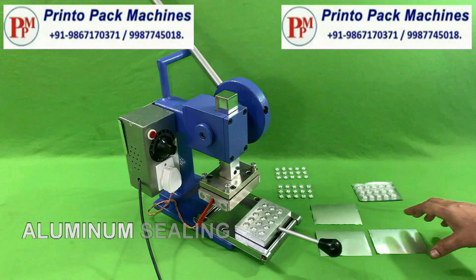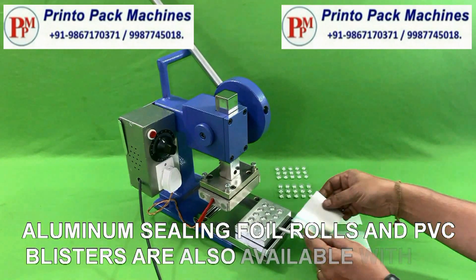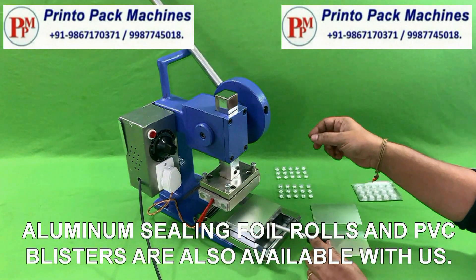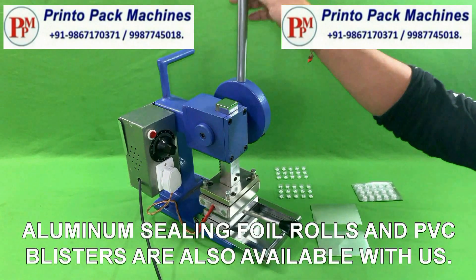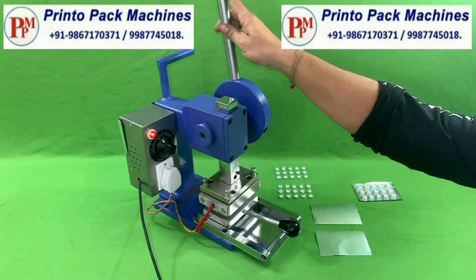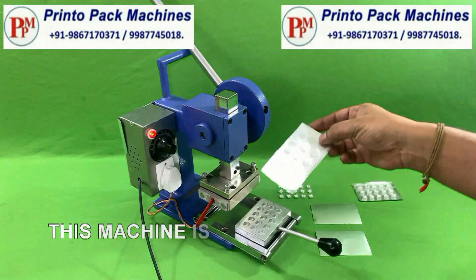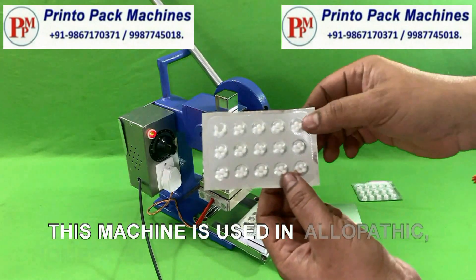Aluminum sealing foil rolls and PVC blisters are also available with us. This machine is used in allopathic, homeopathic and ayurvedic industries.